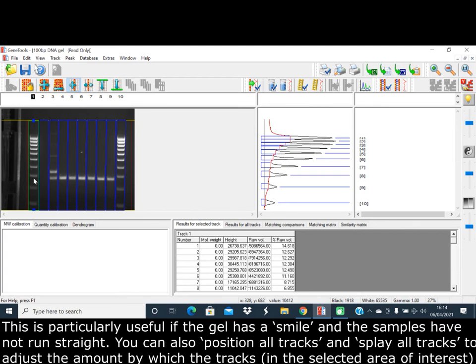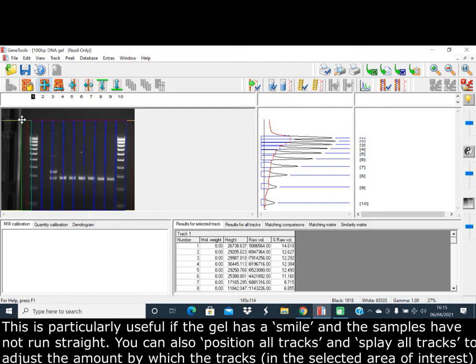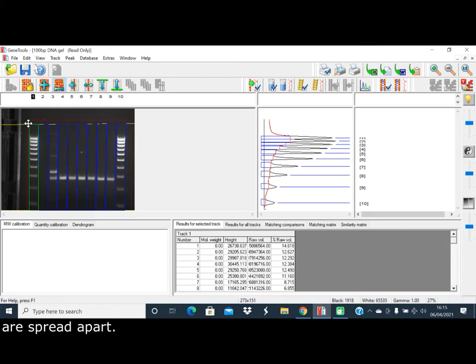This is particularly useful if the gel has a smile and the samples have not run straight. You can also position all tracks and splay all tracks to adjust the amount by which the tracks in the selected area of interest are spread apart.